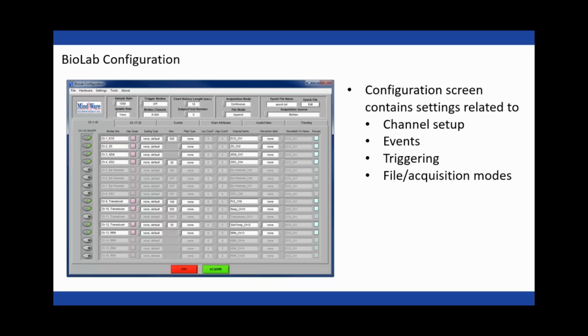The way your files are being saved, whether you're just acquiring a single continuous file or splitting your file up into epochs, that's all configured on the configuration screen. And finally, the audio-video recording is also set up here.